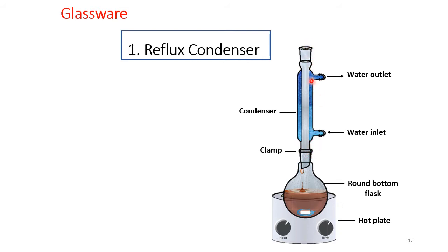And once those vapors are cooled, they will recondense back into the flask, and then I can keep the solvent amount constant within the reaction. As you can see here, those are the dripping vapors, which was the solvent that evaporated on heat, hitting the cold surface and then condensing back into the reaction, so you kept your reaction constant.